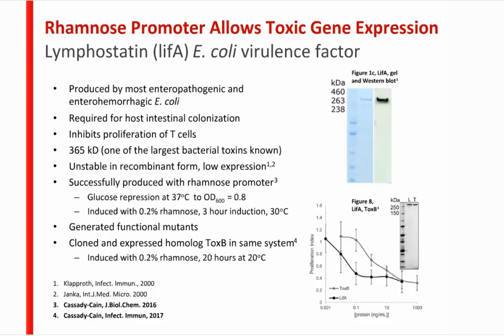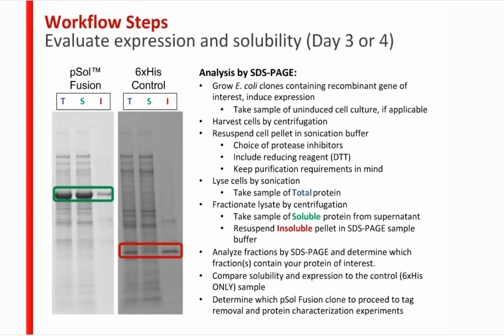So now, let's look at the next step, which is evaluating protein solubility and expression levels. This is the point we all want to get to, right? Here's the data. What we normally do depends on if you do the standard induction or the autoinduction protocol. If you use the one-night autoinduction protocol, you're doing this on day 3. If you do a standard induction where you grow a starter culture and then start an overnight culture from there to induce, then you're doing this on day 4. Just depends on where you are and how you want to do your experiment.